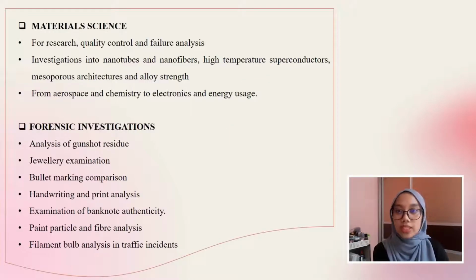First, for material science, SEM is used for research, quality control, and failure analysis. In modern material science, it is used for investigation into nanotubes, nanofibers, high temperature superconductors, mesoporous architecture, and alloy strength. SEM has been used from aerospace and chemistry to electronics and energy usage.